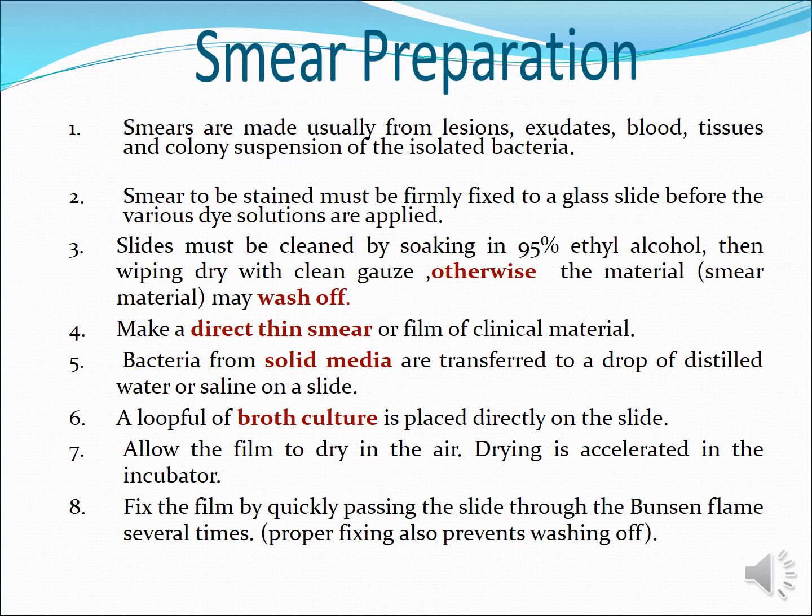How to prepare a smear? Smears are usually made from lesions, exudates, blood, tissues, and colony suspensions of isolated bacteria. Smears to be stained are firmly fixed on the glass slide before various dye solutions are applied. Slides must be cleaned by soaking in 95% ethyl alcohol, then wiped dry using a clean cloth, otherwise the smear material may wash off.